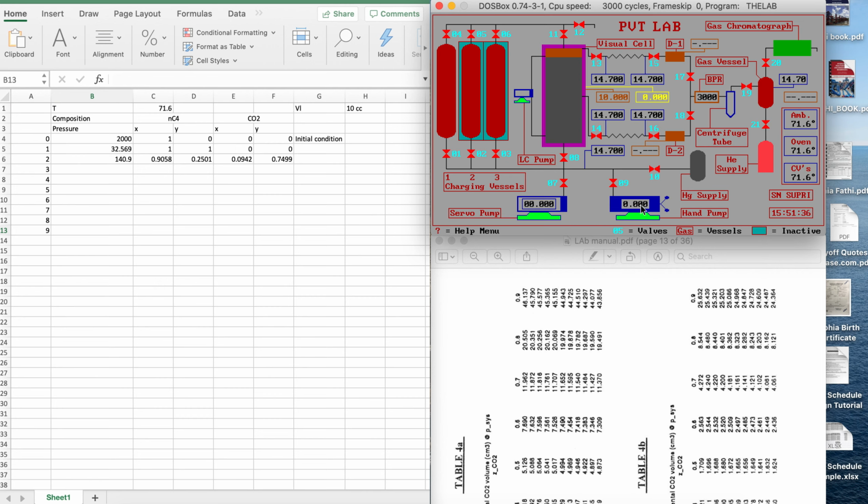46.137 in one step. So what I'm going to do, I'm going to first open valve 8. I'm going to open valve 9. Okay. I'm going to open valve 11. I'm going to open valve 4. Okay. So I connected all these. And now I want to remove, but I know this hand pump can only take 30 cc's.